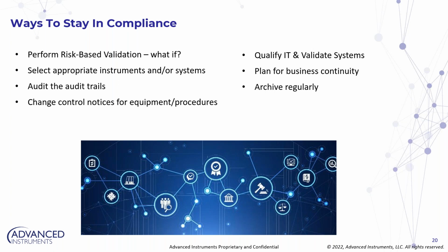Technology is constantly evolving, very much like the biopharmaceutical industry and the drugs. So plan for business continuity. What happens if things change? Or for instance, for a long time, we were talking about LDAP, right? Which was the way of Active Directory, but now it's LDAP-S. Like, how do we make that more secure? There are concerns with just LDAP.